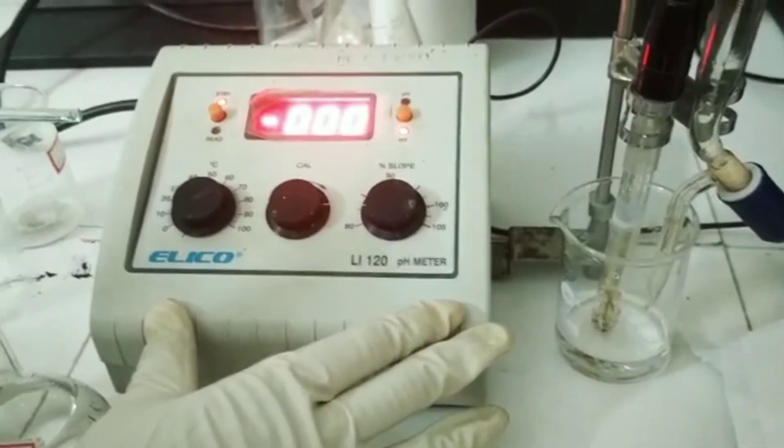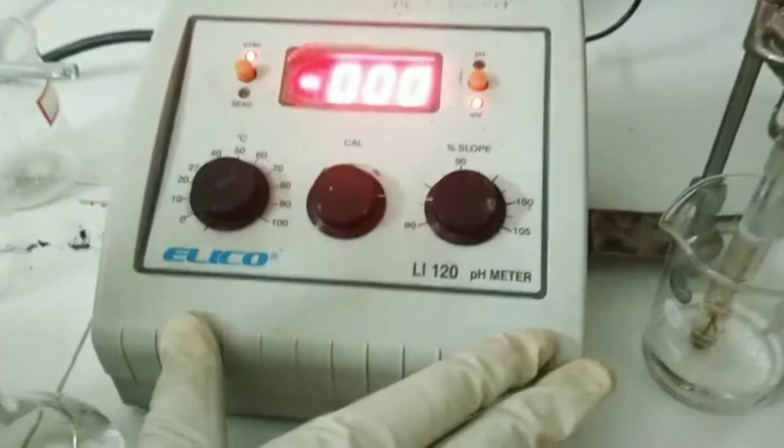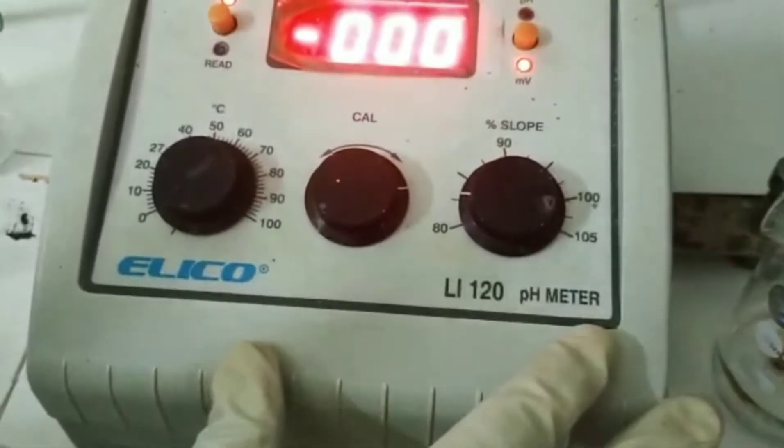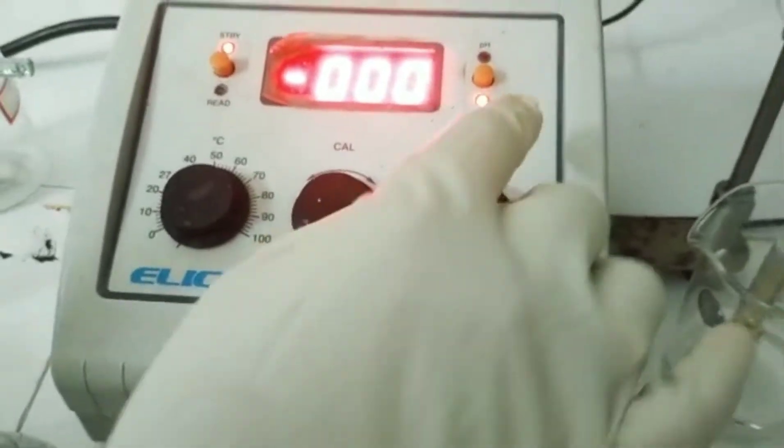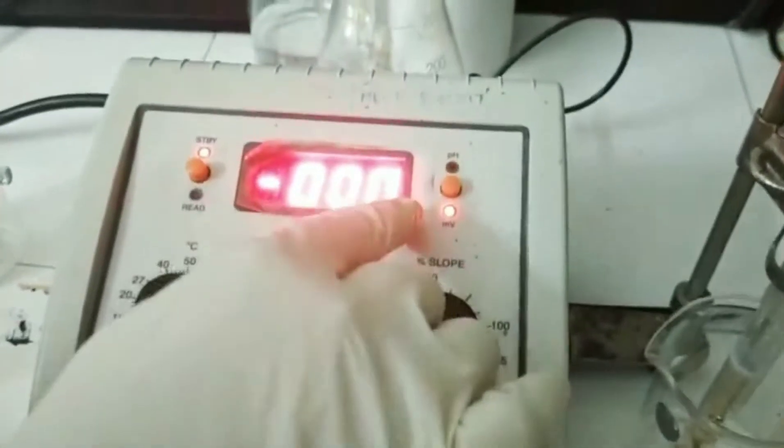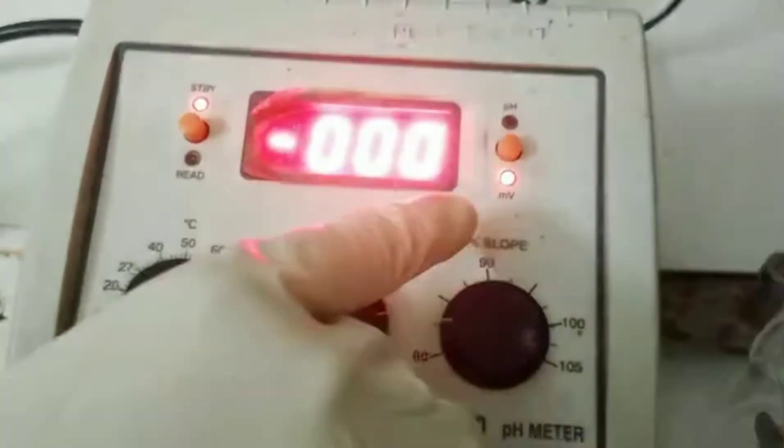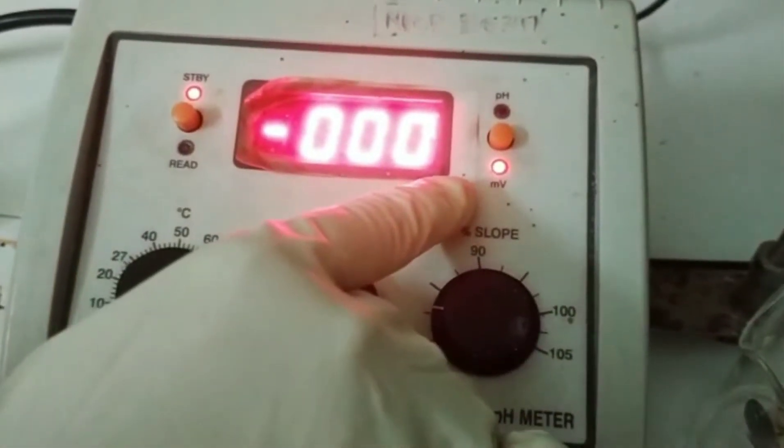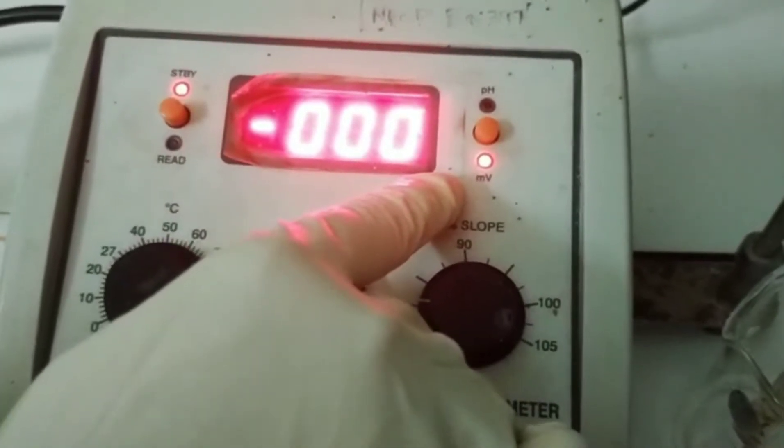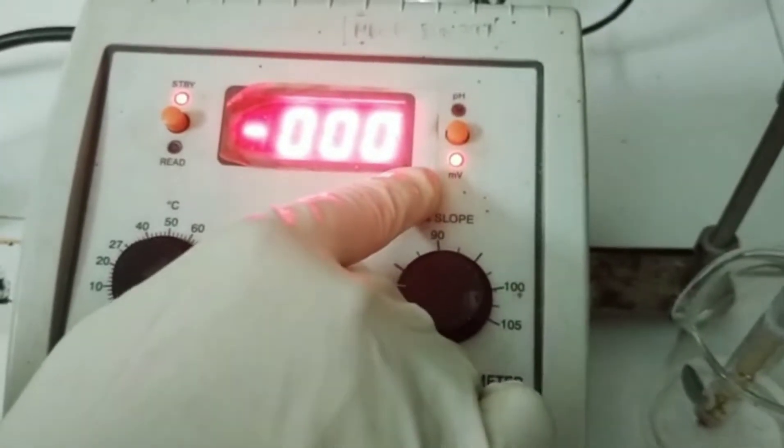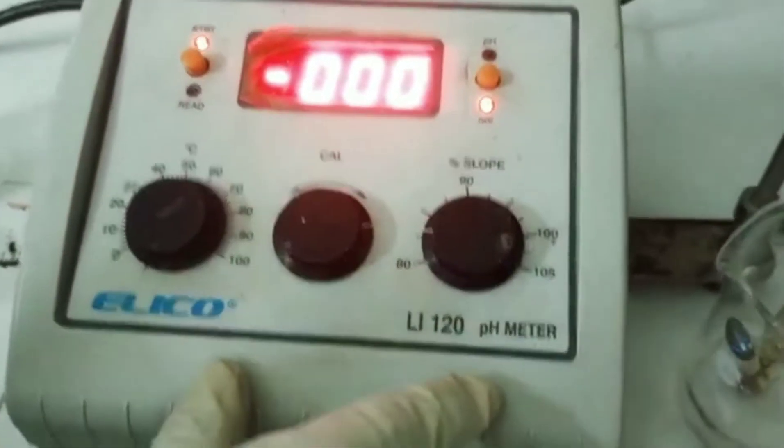Today's potentiometry, I am performing by using ELICO LI 120 pH meter because this particular instrument is having two options here. One is the pH mode and the other one is the millivolts mode, that is measurement of potential. So we can successfully conduct a potentiometric titration by moving on to this voltage mode by using this instrument.